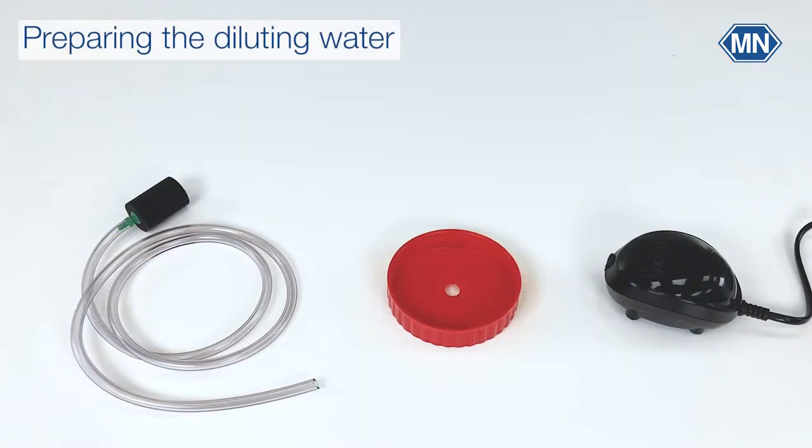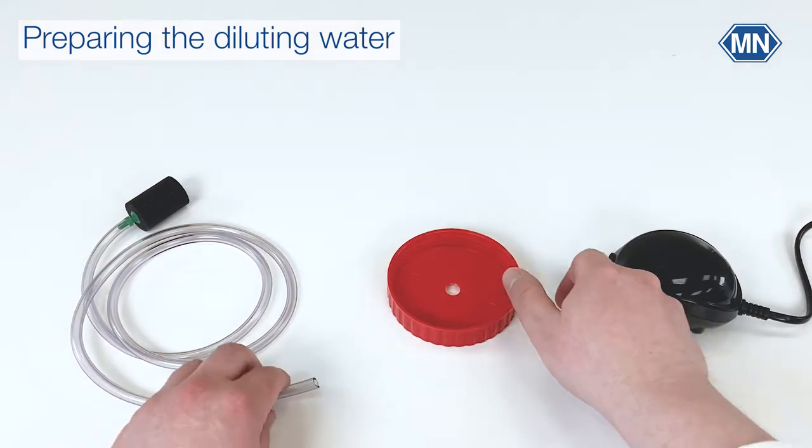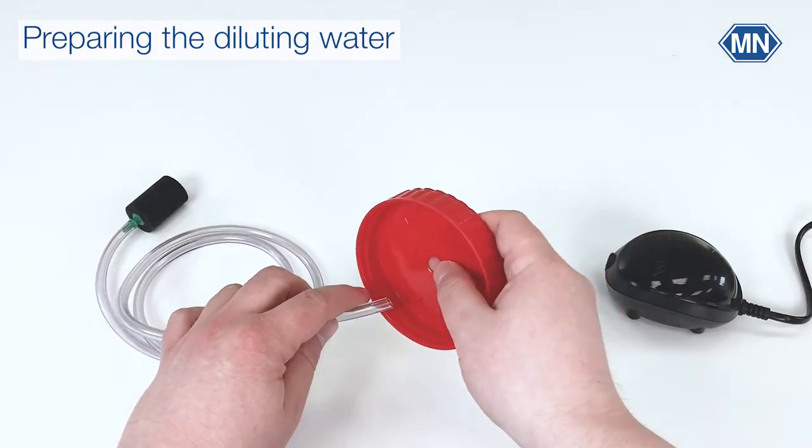Before you can start with the measurements you need to prepare diluting water. For this you need the accessory set. In a first step insert the flexible tube through the borehole of the lid and connect the end to the pump.